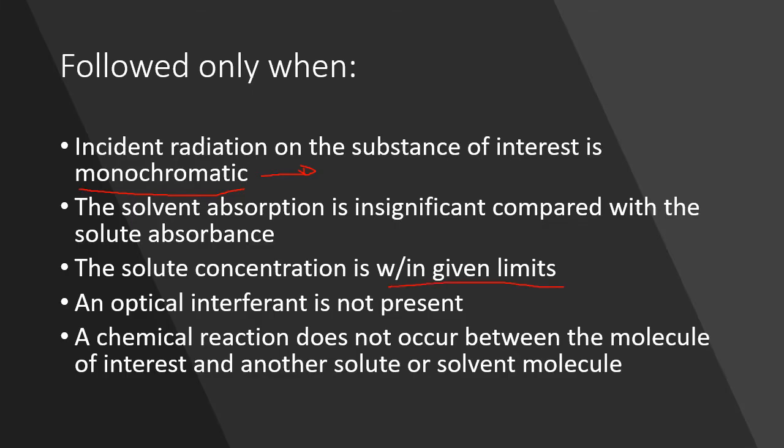Hindi pwede tayong sumobra sa solutes natin. And then, an optical interferent is not present, such as yung mga fingerprints natin. Okay, it's an optical interferent. Next, a chemical reaction does not occur between the molecule of interest and another solute or solvent molecule. So, ibig sabihin lang nito, yung last statement natin, that the solution that is being measured should be done reacting. It should be stable. Okay?